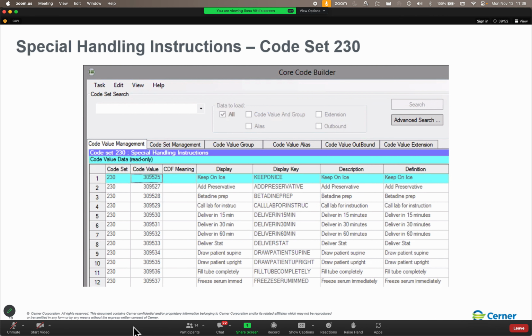Now, that's going to seem reasonable compared to this next one. There's also a radiology specimen. And I know some of you are tilting your head to one side at this point, like Miss Mina does to me when she goes, I have no idea why you're saying that. But radiology does as well. Radiology has got a radiology specimen type out here.